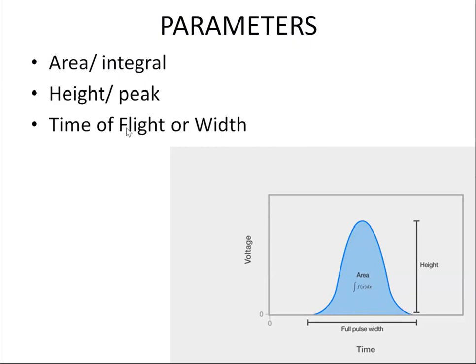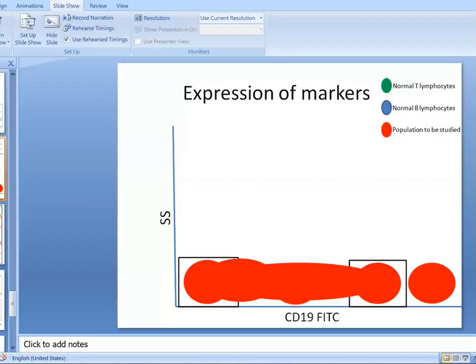Similarly, when you have a forward scatter or a fluorescence, a scatter parameter or a fluorescence parameter, every parameter will be denoted with those things. For example, forward scatter area, forward scatter height, forward scatter width, something like that. Okay, so that is about those things. So I'll show you a case now, and so this is Kaluza. Okay, I'll just drag that file.